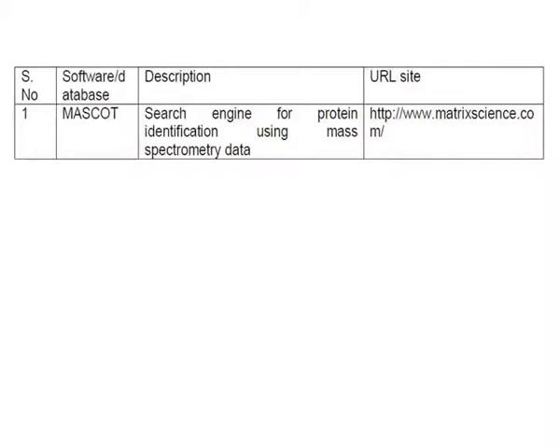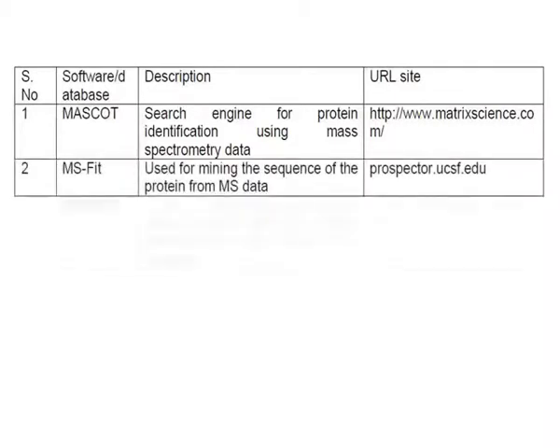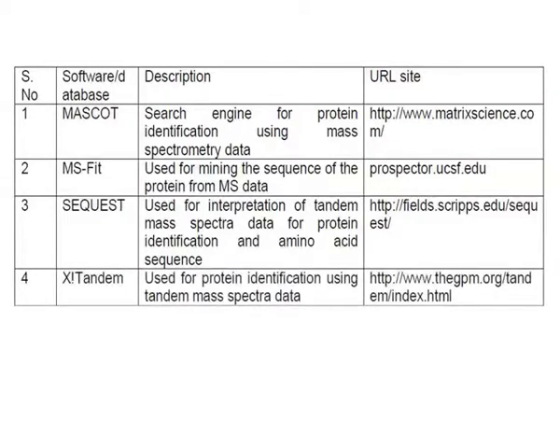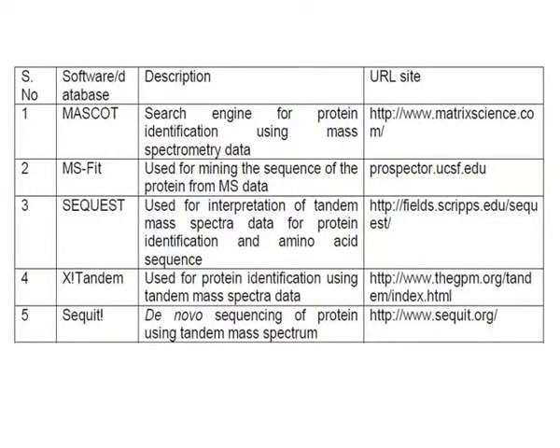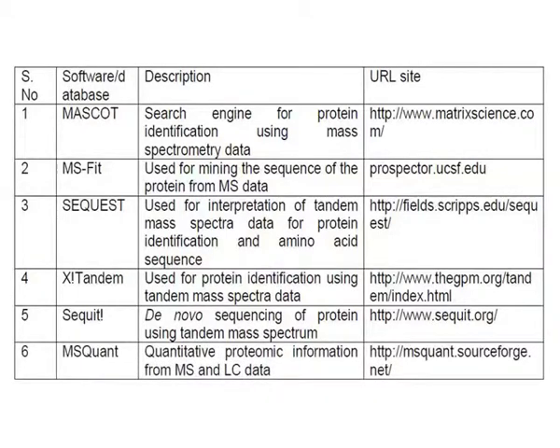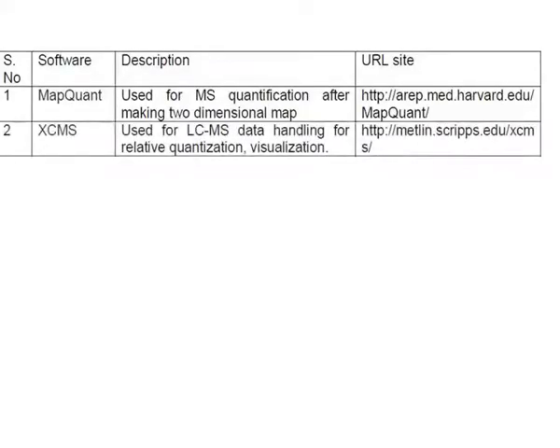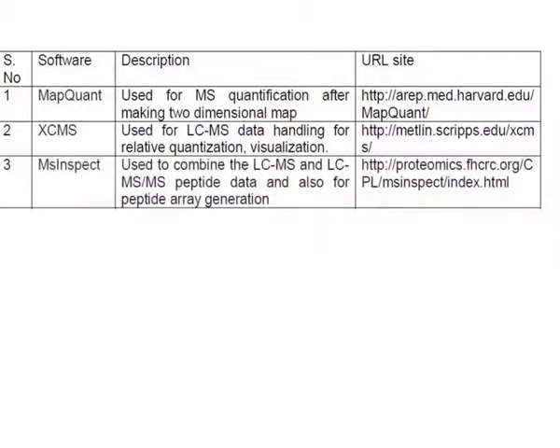Mass spectrometry has succeeded in identifying proteins based on the amino acid sequence information derived from the tryptic digested peptides. To analyze the data obtained from the mass spectrometry, sophisticated databases for protein identification were built, and PMF (peptide mass fingerprinting), PFF (peptide fragment fingerprinting), and MS/MS ion search are the foremost. In the last 2 decades, many algorithms and new tools were developed to process the large data sets.